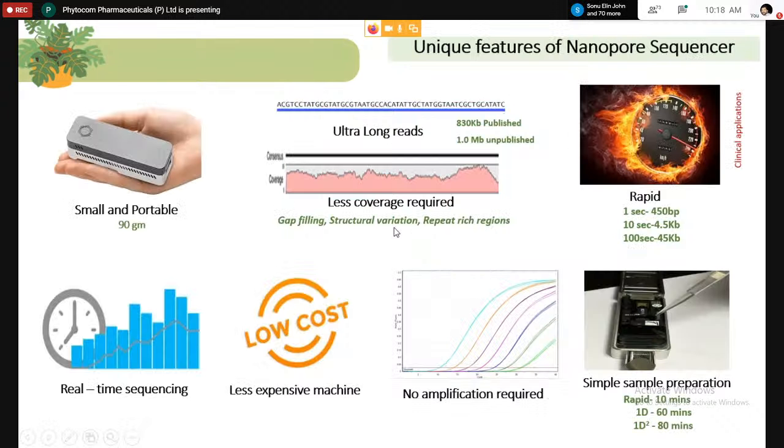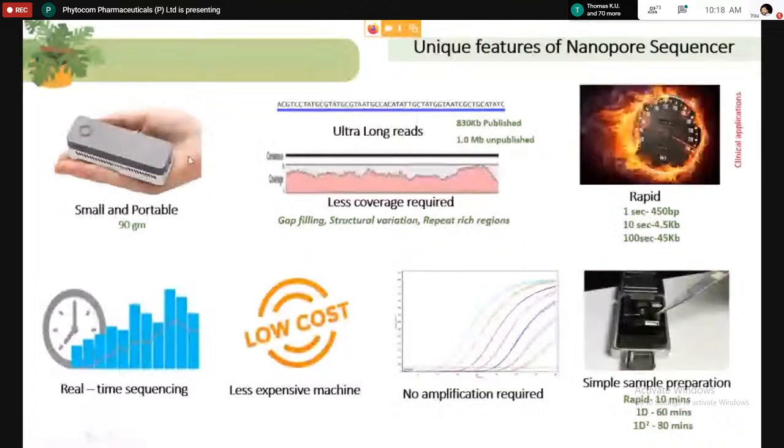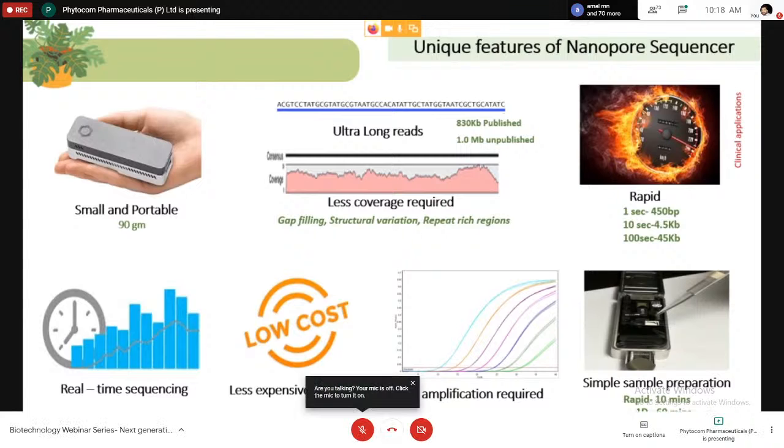So if you see the sequencing machine, this is only a 90-gram small sequencing machine. You can connect it to the computer using a USB 3 port. But the sequence read you get will be more than 1 Mb. Up to 1 Mb you may get.